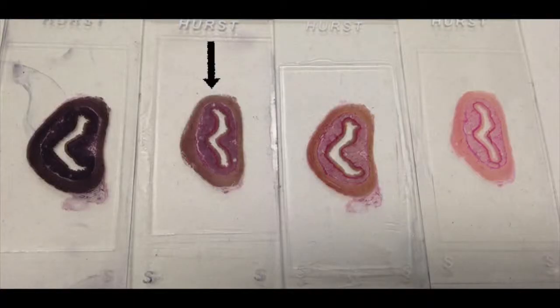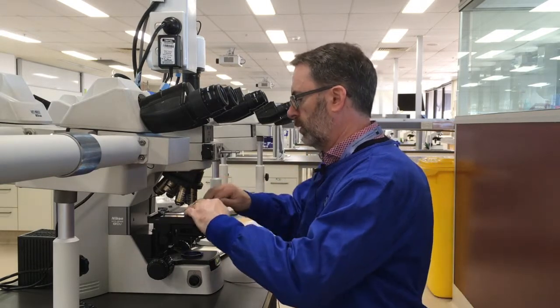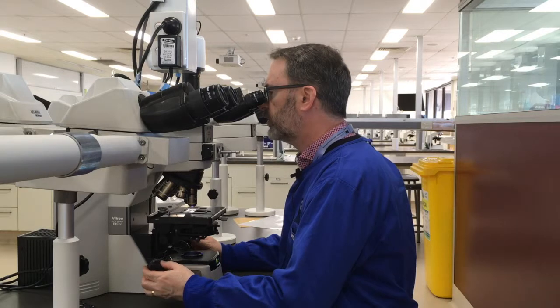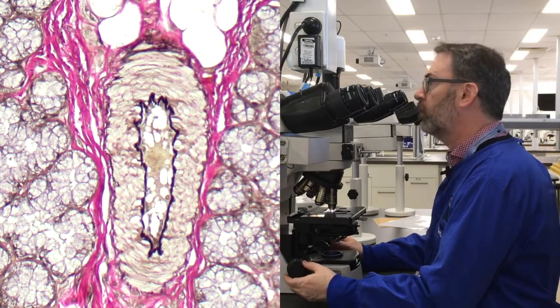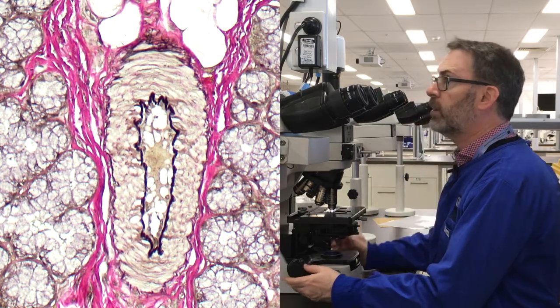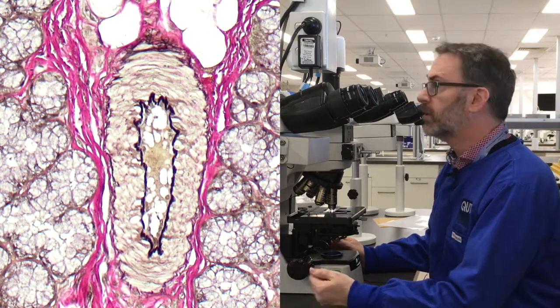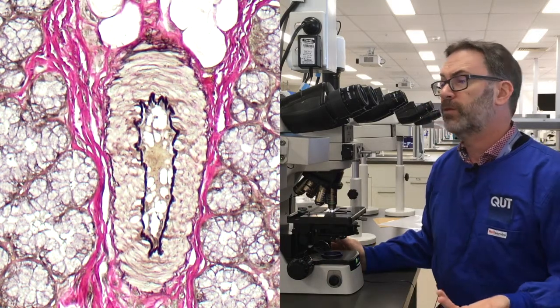Now let's look at something at random — this is more typical of a slide where most people aren't quite sure whether it's been differentiated properly or not. Having seen the other two in conjunction with the well-stained slide, we can consider where this one lies. We've got a nice little artery in the middle with a clear internal elastic lamina. It's clearly useful diagnostically and for research purposes — I think this would be fine.